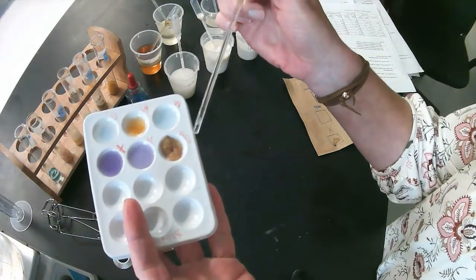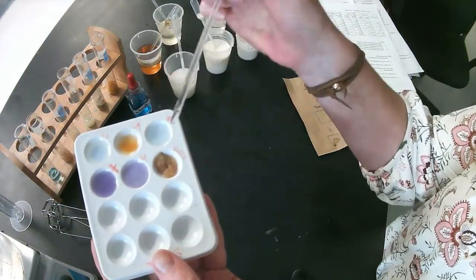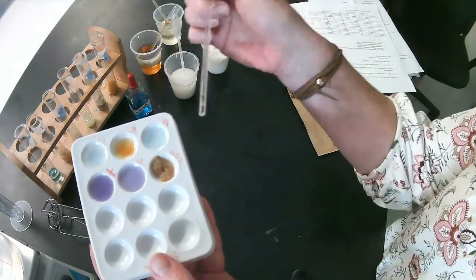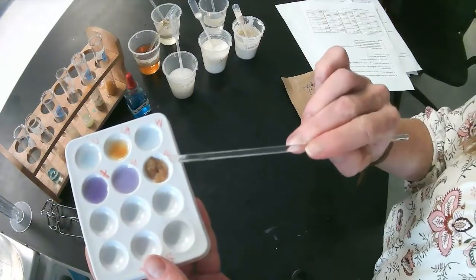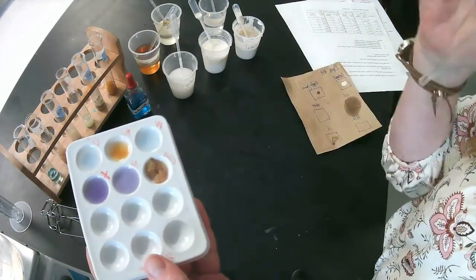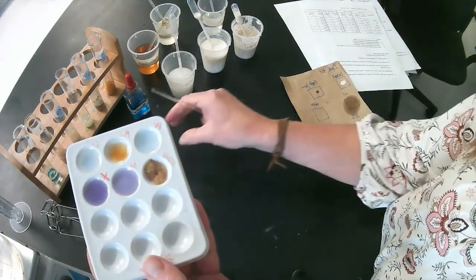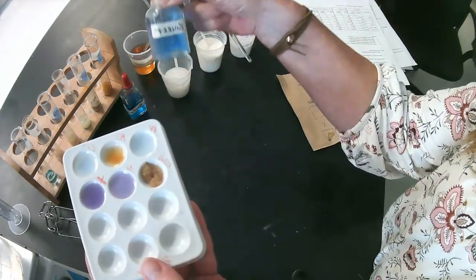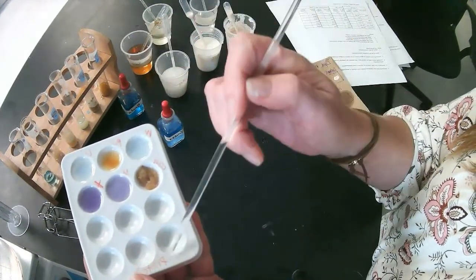Okay, so this was, again, our test for protein. I filled a well plate with each different substance: water, apple juice, oil, oatmeal, milk, and our X factor, or our unknown X. And then I placed in the drops of biuret to test for protein.